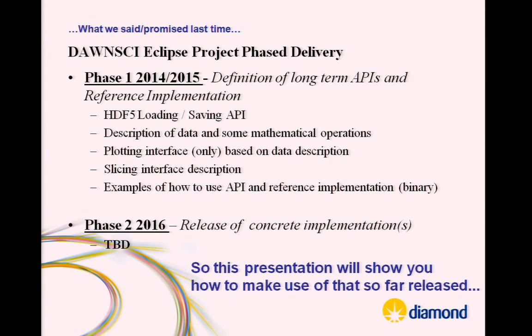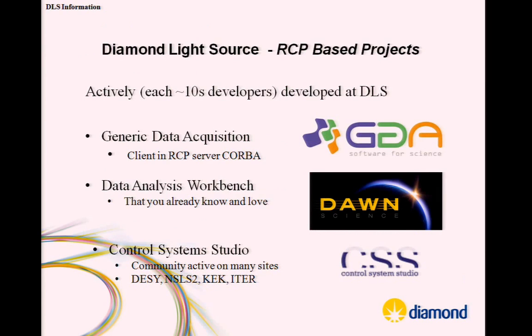So phase 2 will actually be, as we'll say in the conclusion, lots of small things. We're going to look at loading data and then try and get that out open source, and then maybe plotting, and we'll get that open source. So it's going to be a long process, and we certainly ask for feedback and improvements, and working with people, and maybe broadening it out to stuff that we haven't implemented, that other people have implemented. So we're trying to be collaborative.